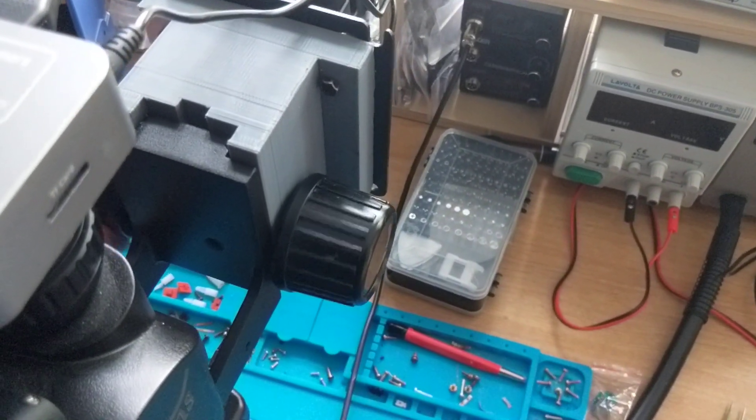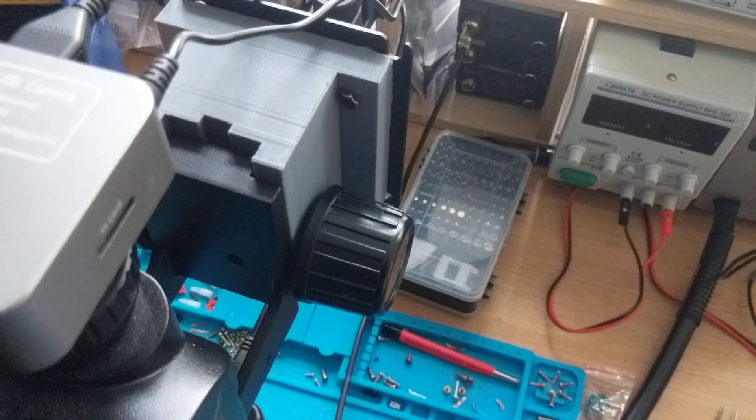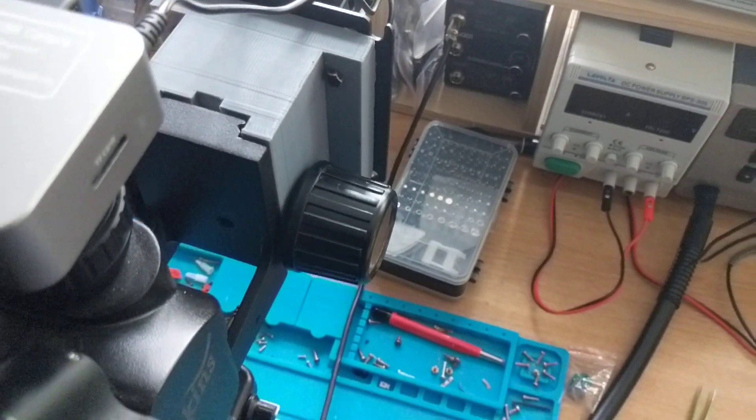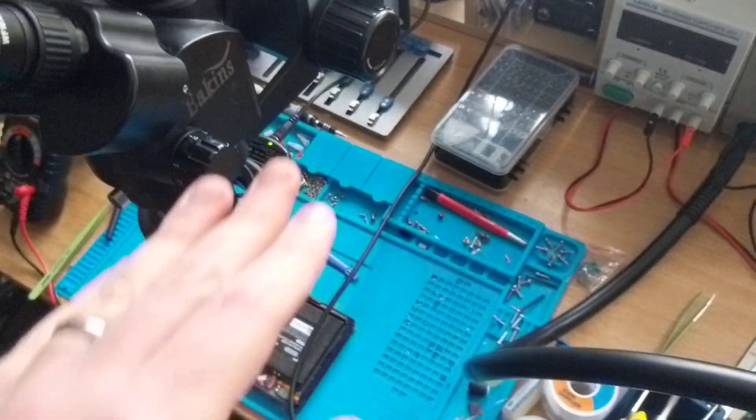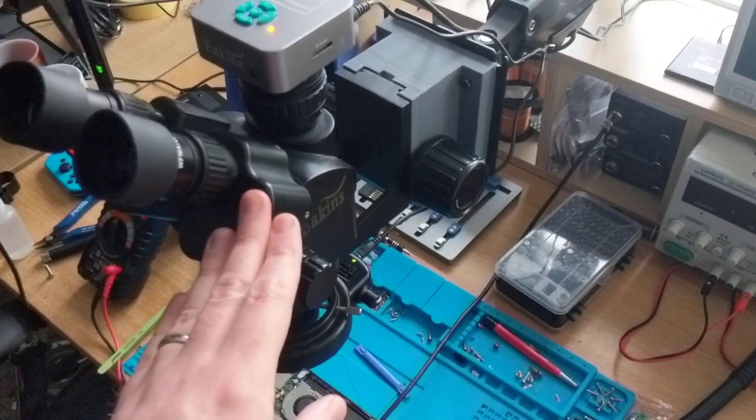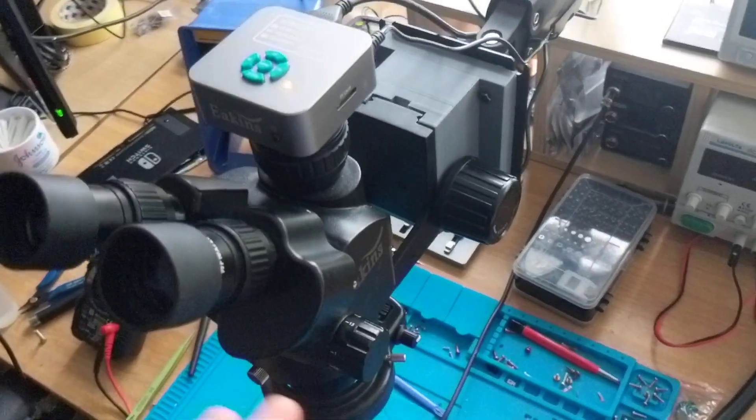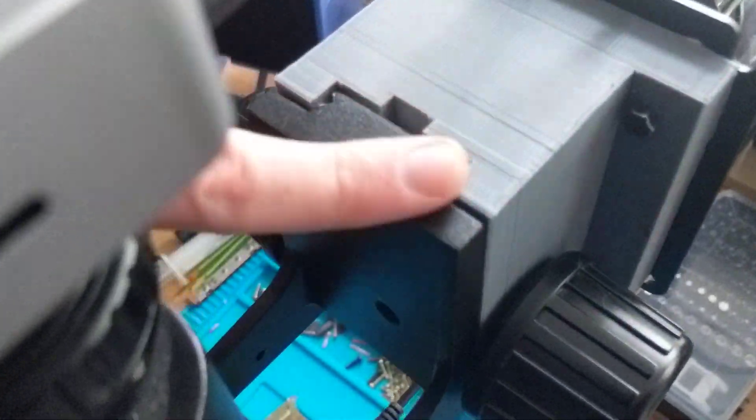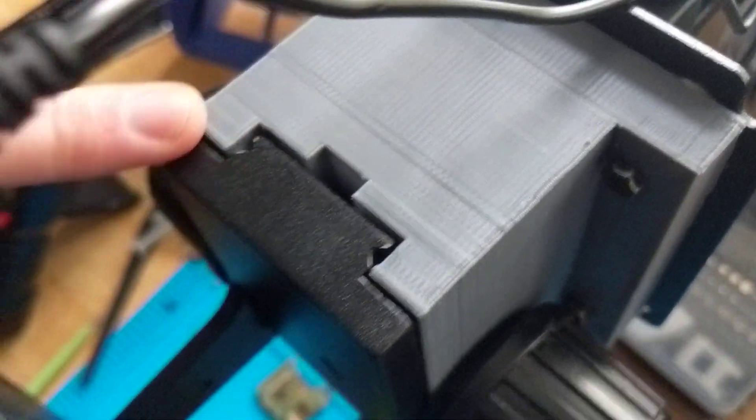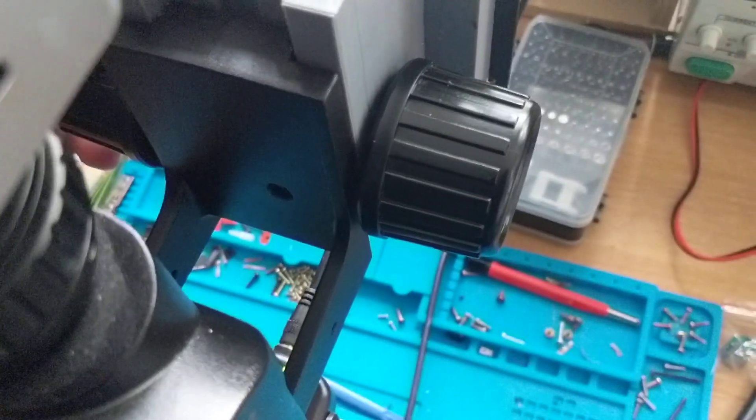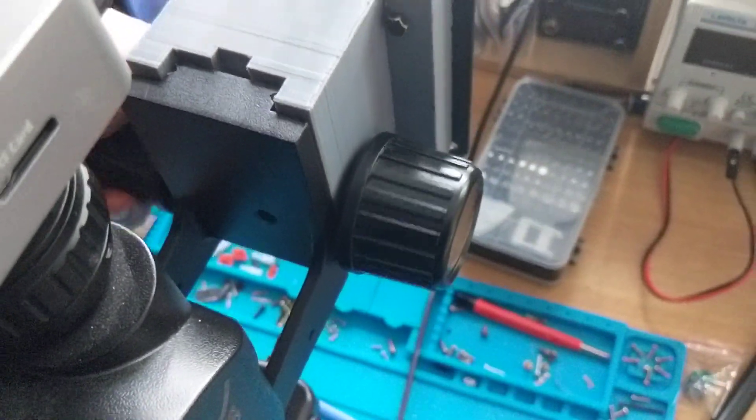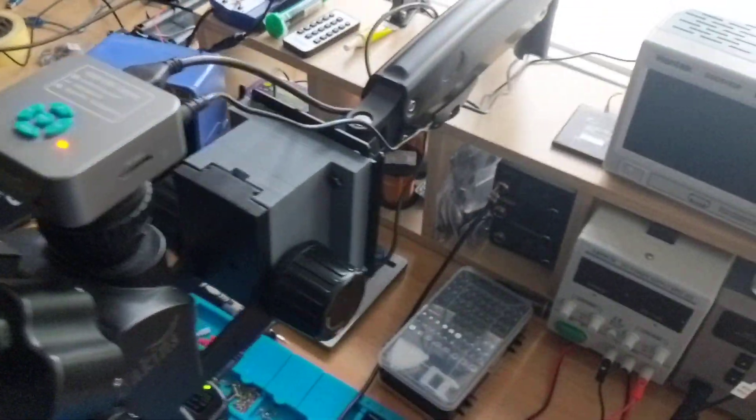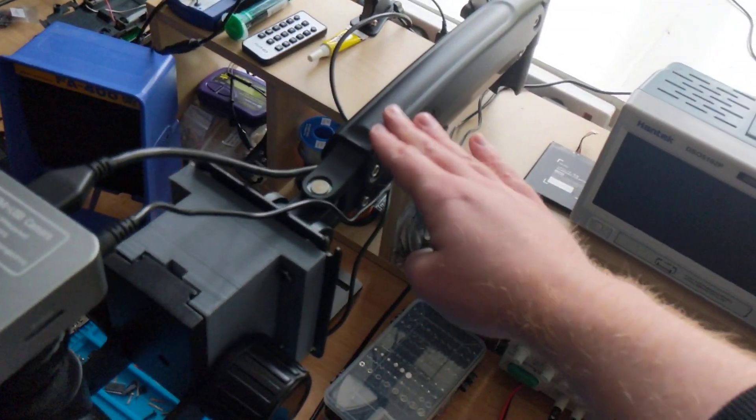As we can see the focusing wheels work just fine. If you already have one of these trinocular microscopes or even a binocular one that doesn't have the adapter, they all have this same sort of universal mounting system here.